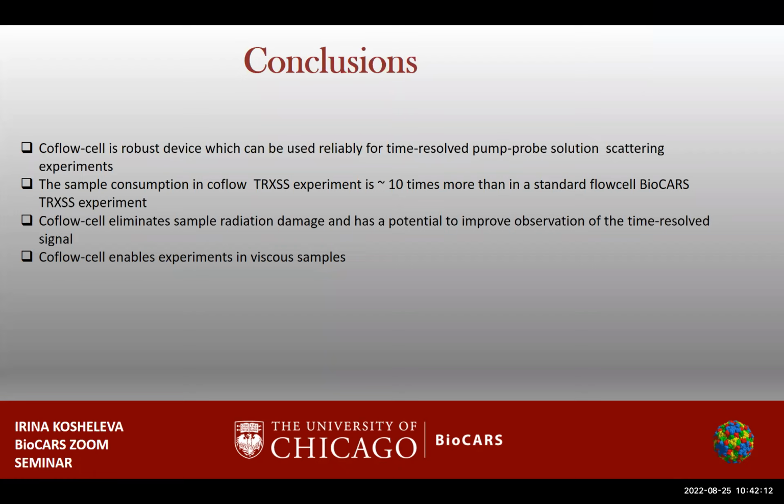Alternatively, I was just wondering, why don't you use an immiscible liquid for the outer, like a fluorocarbon that's the same density as water and same viscosity, and then phase separates later? You know, Friedrich, you're right. But firstly, I do not know what will be the chemistry on the boundaries, and secondly, last time I checked, there were some problems with the toxicity and flammability of those liquids, but maybe I have to look more closely into this. This is an interesting suggestion, actually.